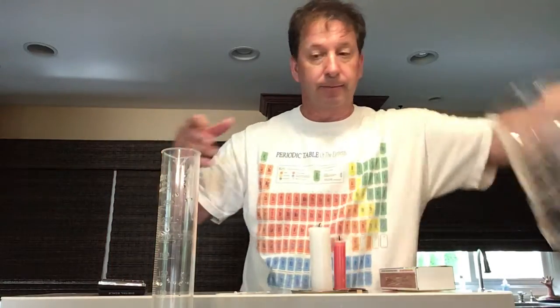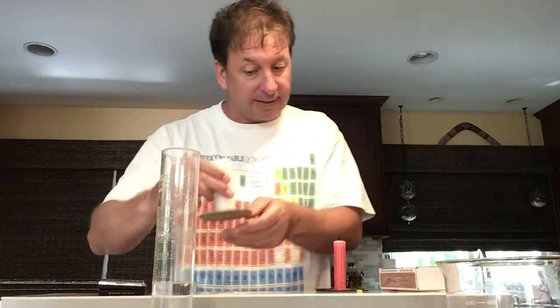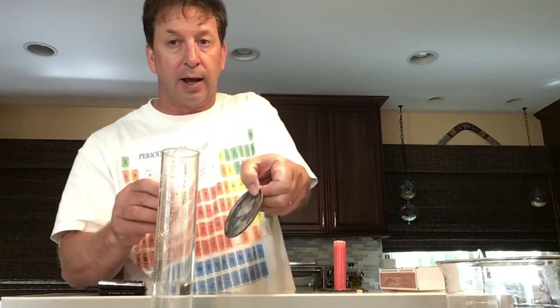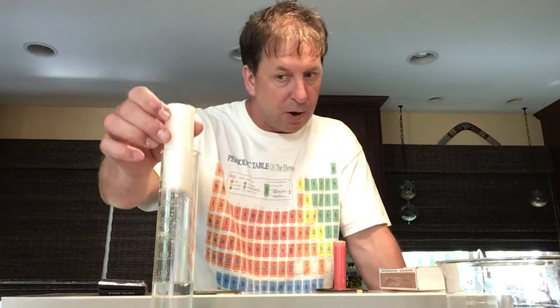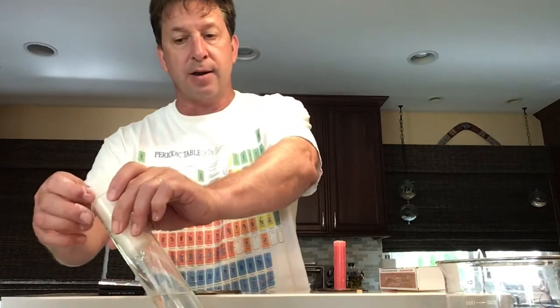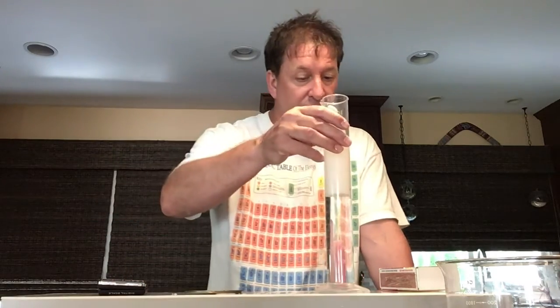We're going to see what happens to the mass as you burn a candle. We'll also record the volume using the water displacement technique. One problem you'll run into is that some wax might have dripped onto the container, so you might want to add one or two milliliters when you record your final volume. We'll wait until the wax is hard, record our initial water volume, put the candle in, push it down, and record the new volume.